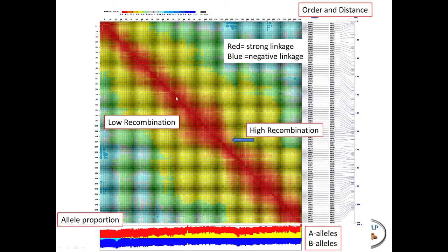So there's a number of things you see here, although it can be fuzzy. The areas that have large spots, I mean there's a lot of markers in this area that are tightly linked. So those are areas of low recombination. And sometimes you'll see a constriction of the graph here. You'll see finer constrictions in further graphs that I'm going to show. These are areas of high recombination, essentially. And you can actually see each of these pixels lines up directly to the marker over here on the right. And you actually have your genetic map over here on the right as well.